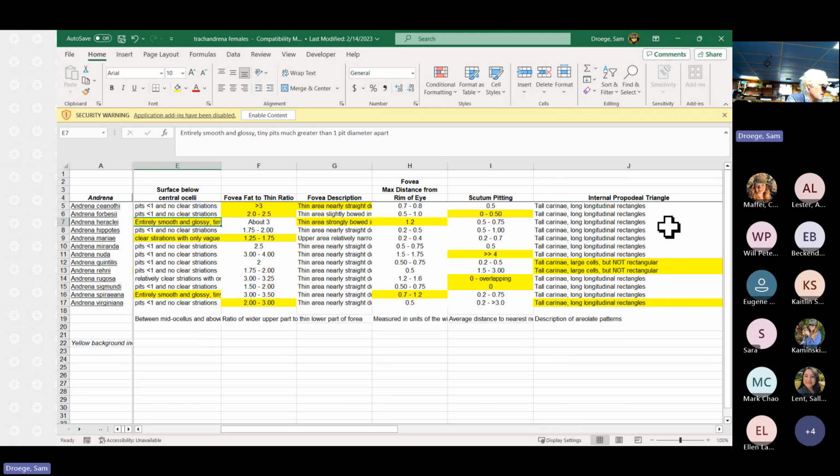And can we see? Yeah, we can see that the face, if the hair is matted quite a bit, this is a generic problem. That's why washing and drying your specimens rather than pulling them out and pinning them up out of alcohol is so much better. If they're matted, a lot of times important features like the facial fovea become obscured.